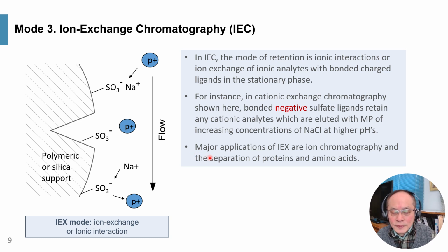Major applications of ion exchange chromatography are ion chromatography, IC, and also the separation of proteins and amino acids.